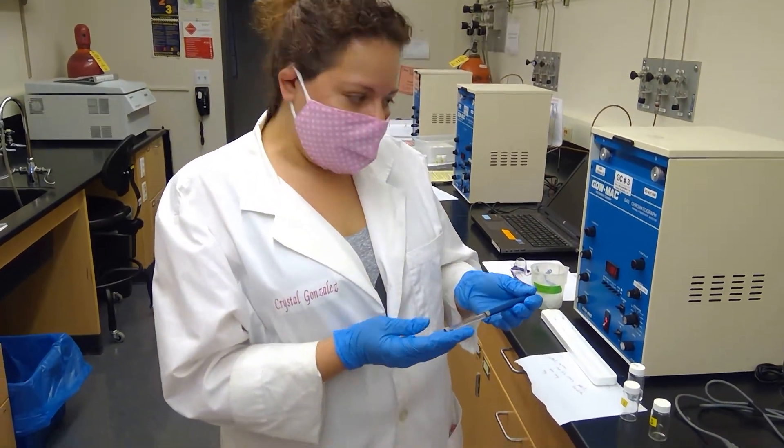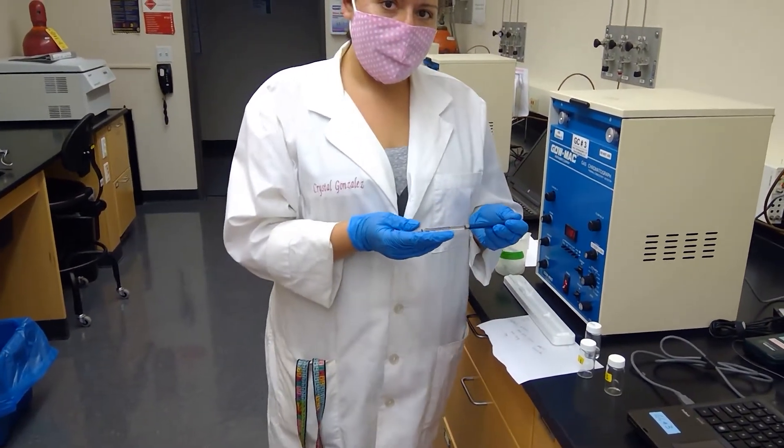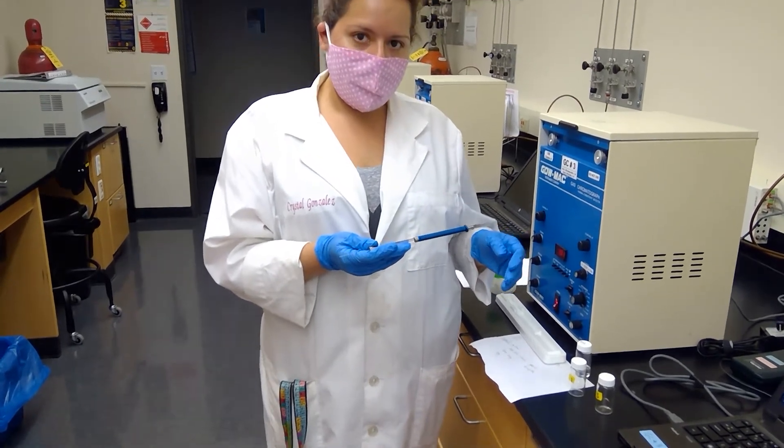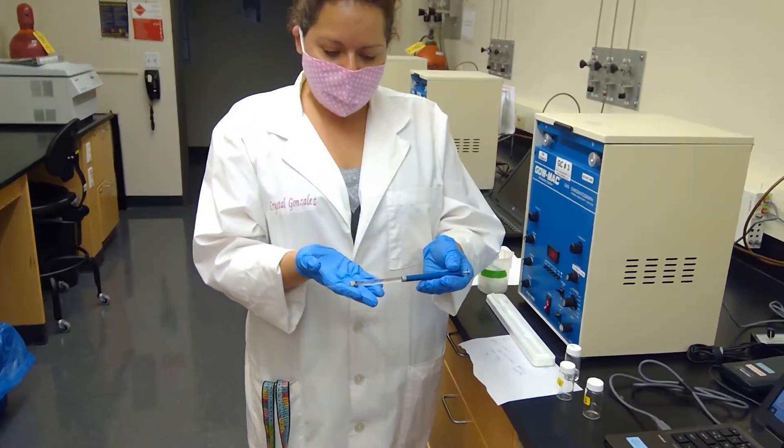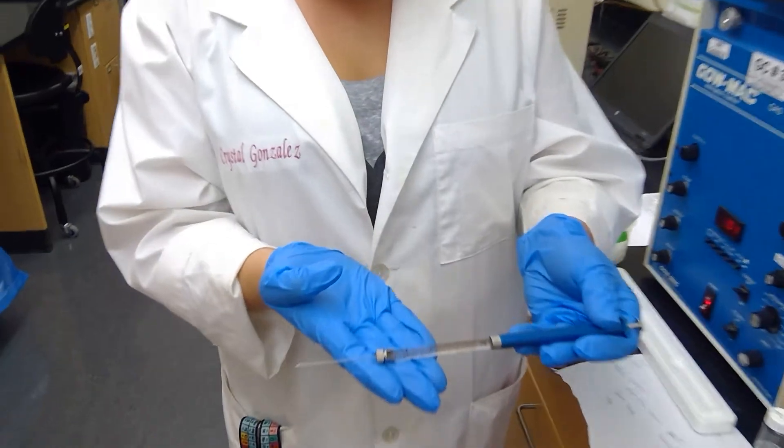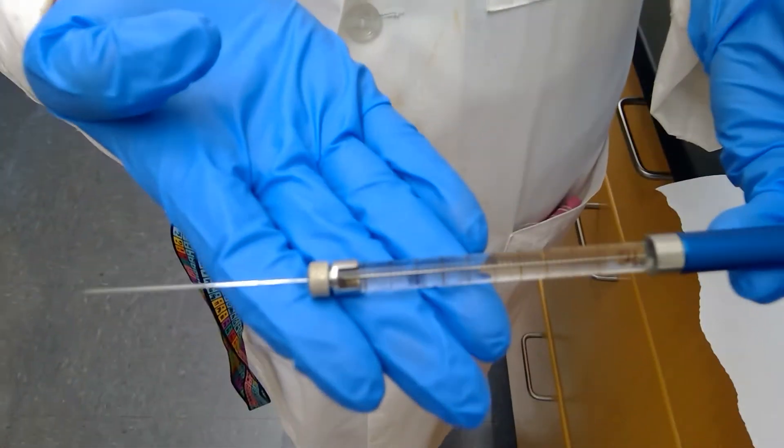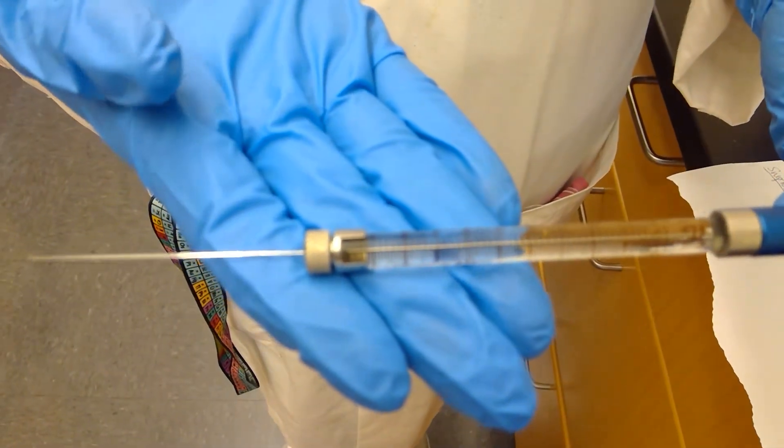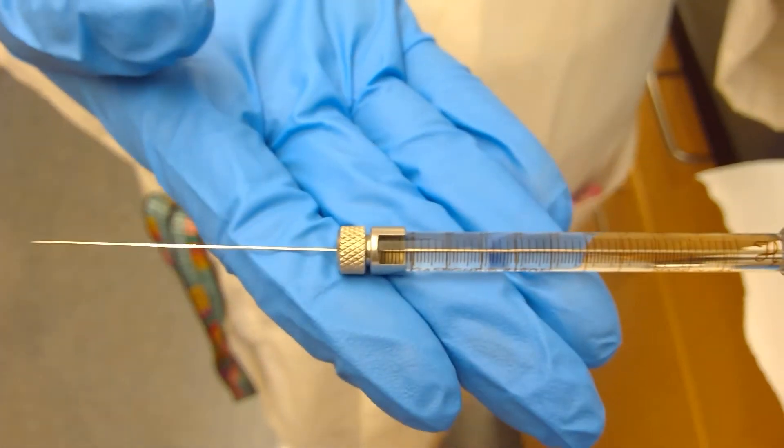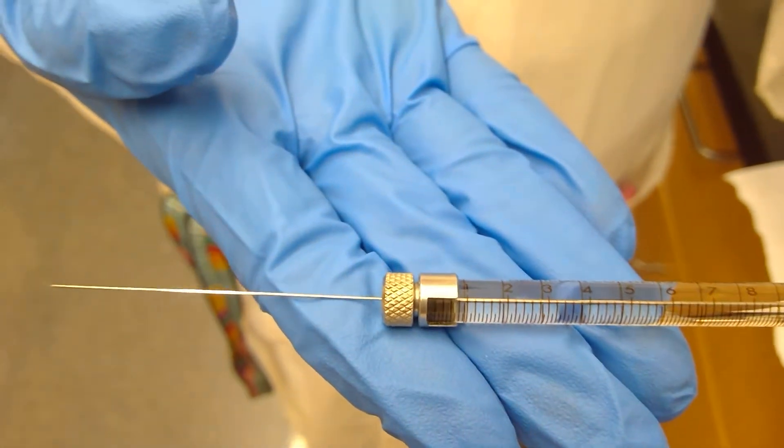All right, students, so we are going to do the gas chromatography for our sample from the caraway oil and in my hands here I have a Hamilton syringe, which is an old type of syringe. It's made out of stainless steel parts and glass. This particular one has a maximum volume of 10 microliters.